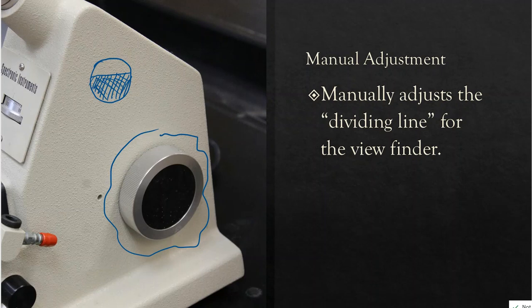And it's going to be up to me because there's going to be some crosshairs that are here, right? And it's going to look like this, maybe somewhat in the center. My drawing's kind of off. But it's going to be up to me to lower and raise that dark and light half until it really does get on the center. I mean, that's really what I'm after right there. So this is the knob that does it. It is my main adjustment tool. And you'll see that when I show you an image of the viewfinder in just a minute.